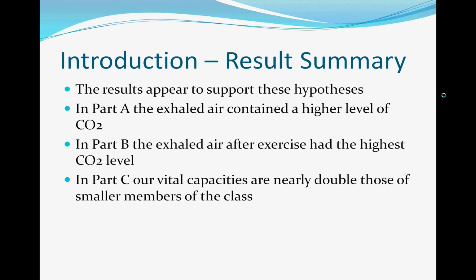A summary of the results we found. Part A, we found that exhaled air contained higher levels of carbon dioxide when compared qualitatively to room air. Part B showed that the air exhaled after exercise had higher CO2 levels, again qualitatively, than the air exhaled before exercise. Both exhaled air tests revealed that they had higher CO2 concentrations than the room air. Part C, lastly, we found that vital capacities are nearly double those of the smaller members of the class for tall males. All three results appear to support our initial hypotheses.